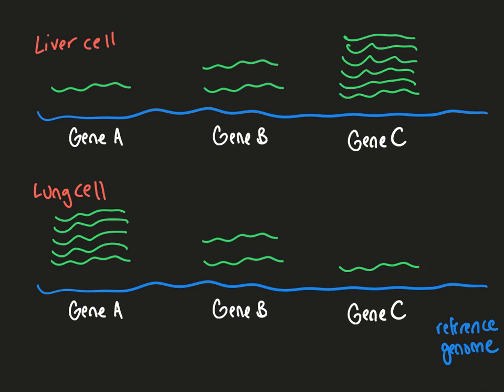So this type of biological question is a little bit different than what we've been addressing so far, because while variants may exist in the sequence here, this mapping doesn't have to be perfect to the reference genome, by the way. We've talked about this a little bit. There may still be a one base pair substitution in this read. For the most part, when you're looking at RNA-seq data, you're not usually concerned with detecting sequence variants. You're concerned with detecting transcripts, that is, maybe seeing which exons are present, what alternative splice options are available in the cell, and you're also interested in comparing the expression of different genes between different conditions.